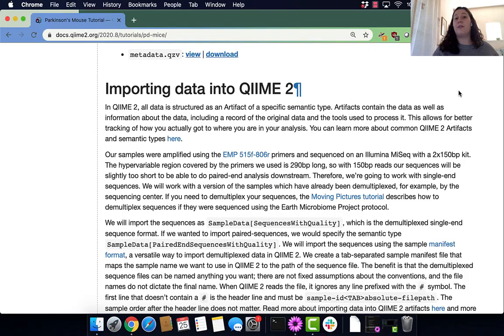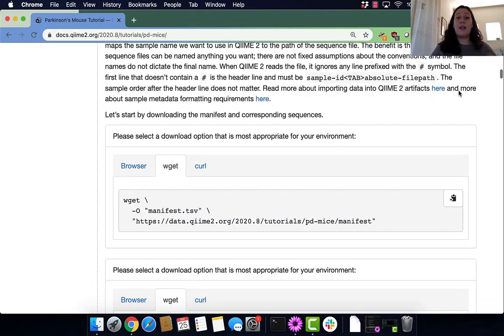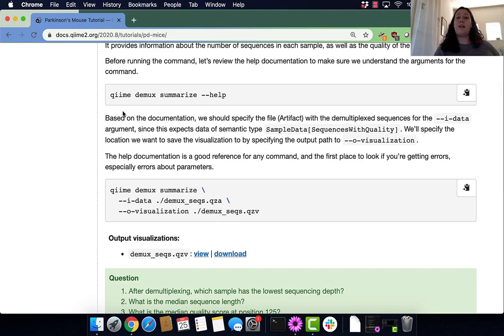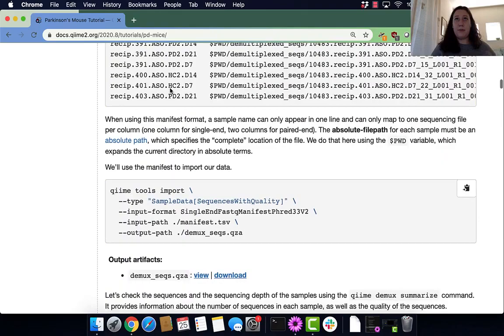Hi, my name is Chloe and welcome to the section of the tutorial where we learn how to import data into QIIME 2. In this section we will be running two major commands: qiime tools import and qiime demux summarize.